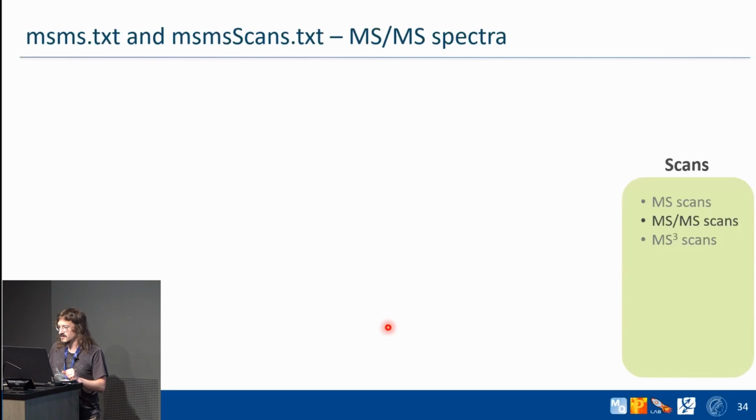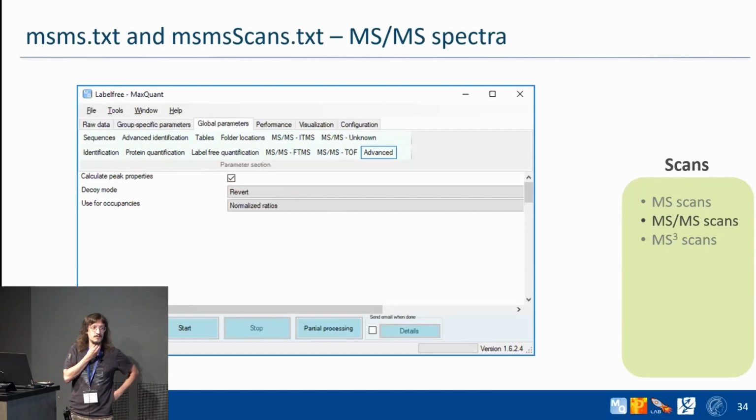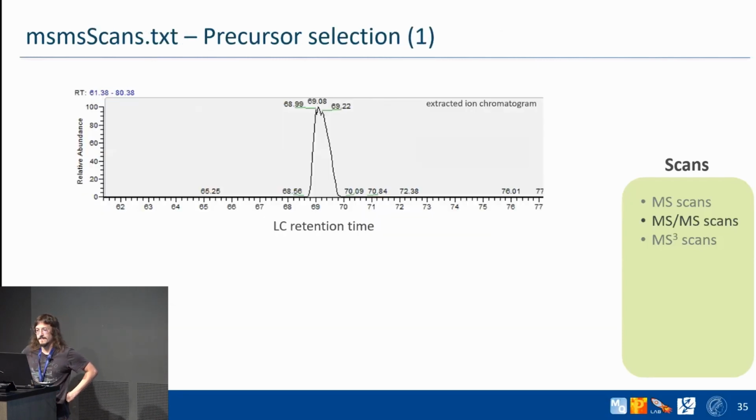But let's go. Here, as we can imagine, we have MS1, MS2, and MS3 if you've done that. But usually these are not output tables that you will get normally when you run MaxQuant. You need to check this box. When you check it, MaxQuant will give you also the information about these MS runs. But normally it is unchecked. So if you're specifically interested in this, check it, and then you can look at your data. How it will look is something like this, for example.